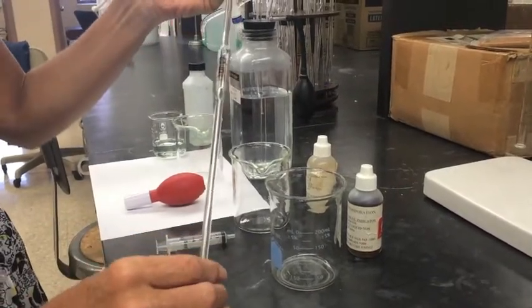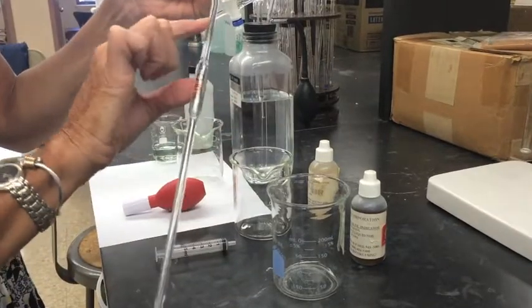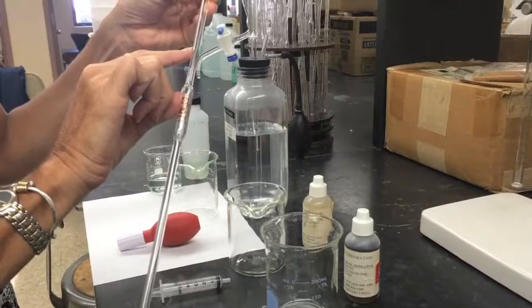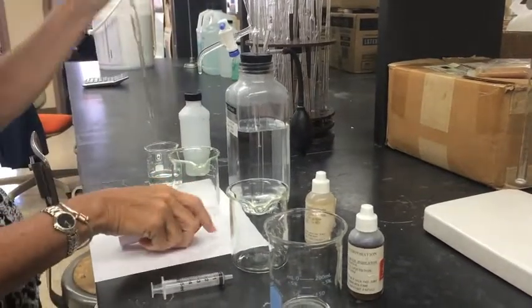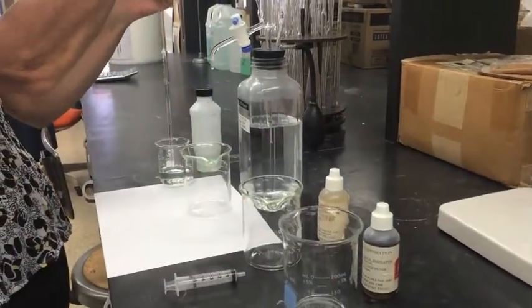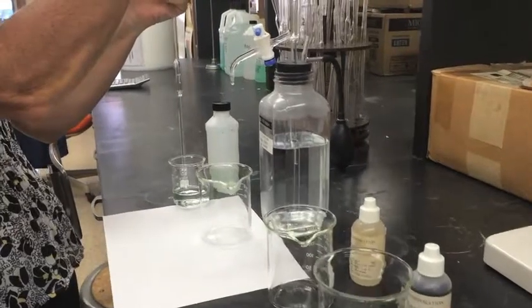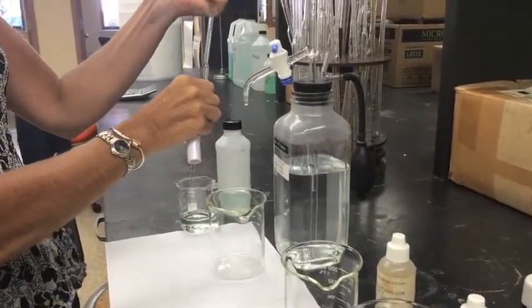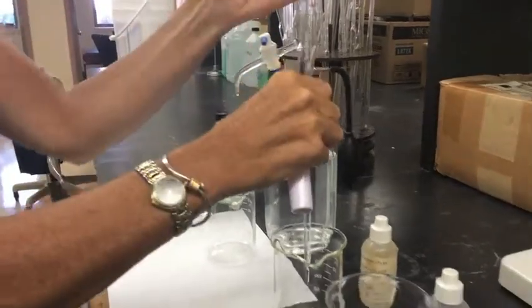We use a glass pipette, which is calibrated for 5 mils by filling it to the line you see here. So basically we'll fill up the pipette to the 5 mil mark, and transfer it into a clean beaker.